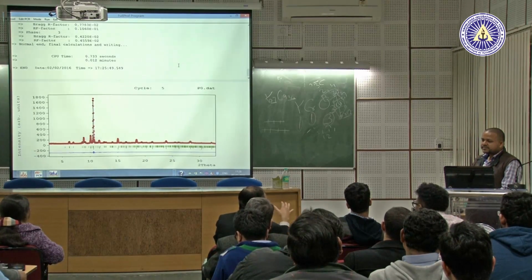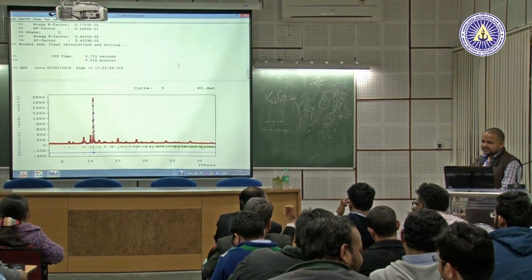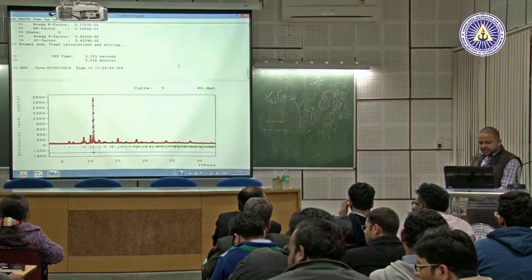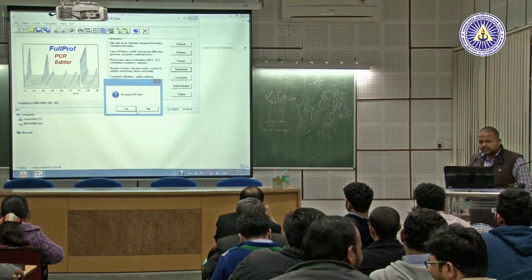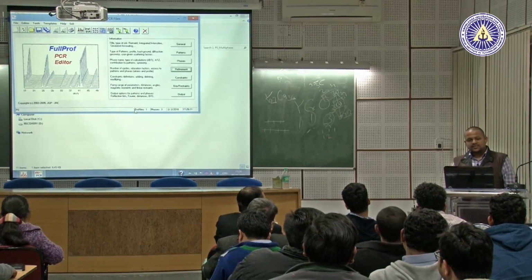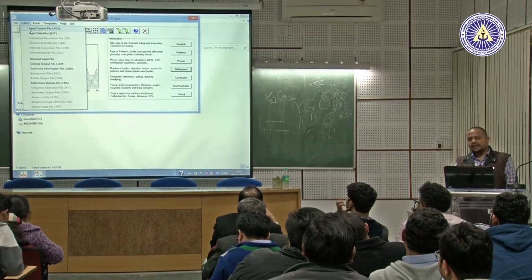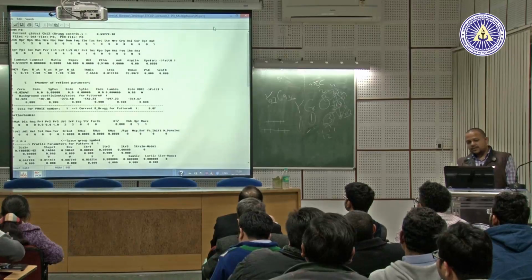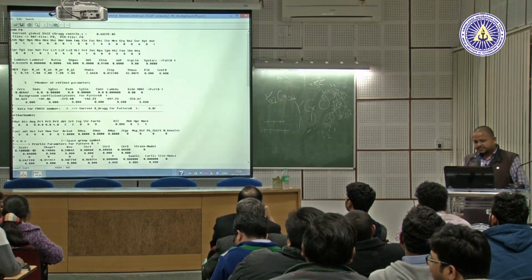The reason I'm asking is that even for texture, earlier we used to buy software worth lakhs of rupees. Now we use freeware. It's totally free. And suppose somebody doesn't want to use the click, so for those people the software works by commands. The window will appear as here, and you can control it from here also, but it needs practice.